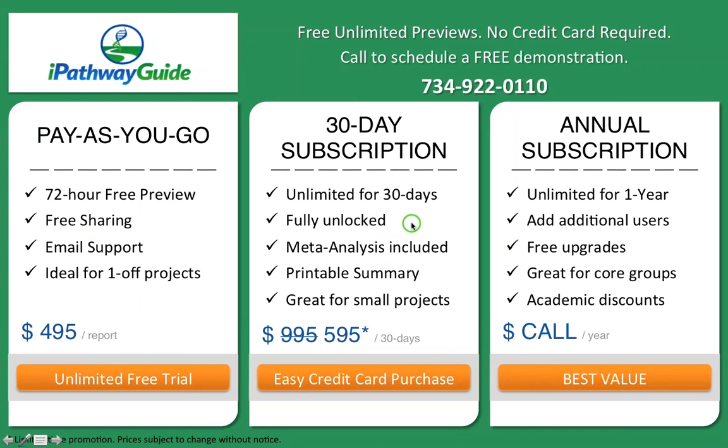Then we just launched this month a 30-day subscription, and this provides you with unlimited access for 30 days. Everything is unlocked, including the meta-analysis and the printable summary. And all of those data sets that you run in that 30-day period will be available to you for life, and you can continue to come back to them and use them in future analyses for, say, a meta-analysis.